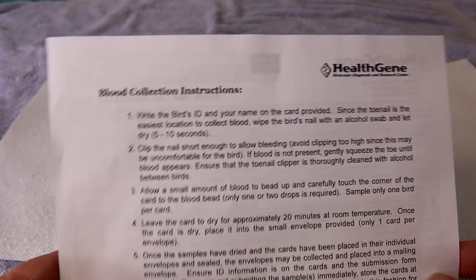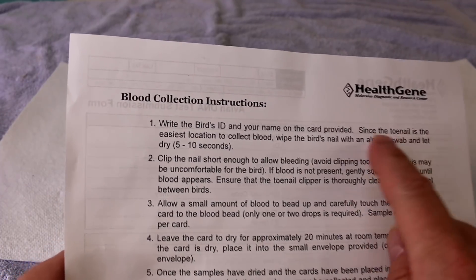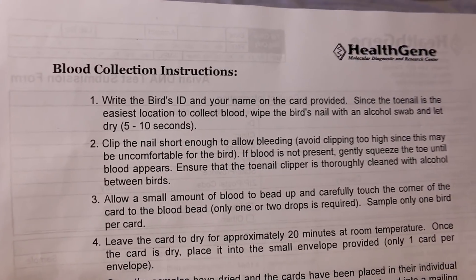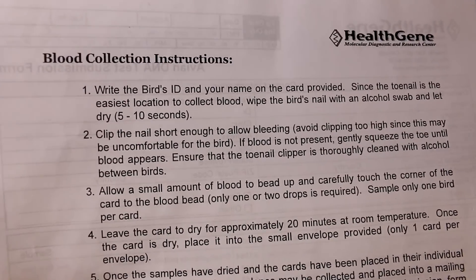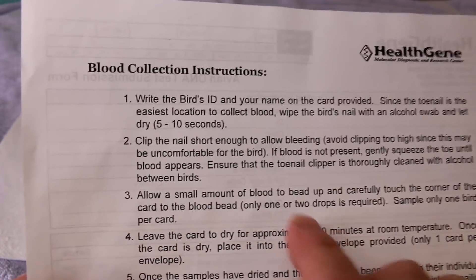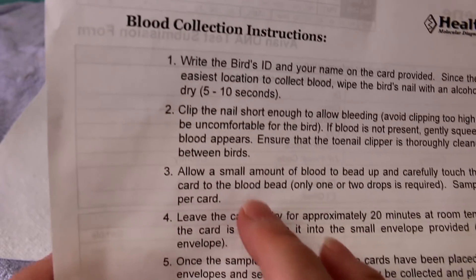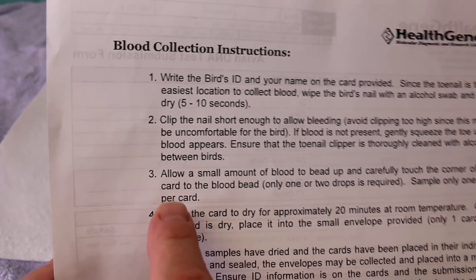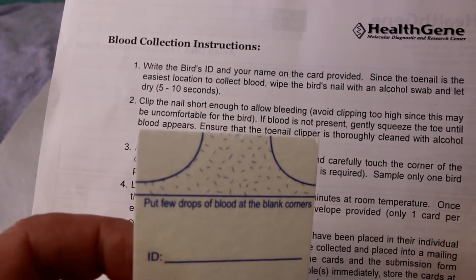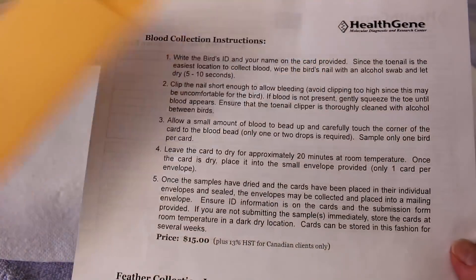Let me explain how I'll do the DNA test before I actually do it. Once I fill out the cards with the ID, species, and all that, I wipe the bird's nail with an alcohol swab, wipe the nail clippers as well, and let it dry for five to ten seconds. Then I clip the nail just below the quick — you don't want to cut it too short or in the middle of the quick. You just want to cut right to the end of the quick so you get a bead of blood. I allow a small amount to bead up, carefully touch the corner of the card on both sides, let it dry for 20 minutes, put it back in the envelope, and send it in the mail.